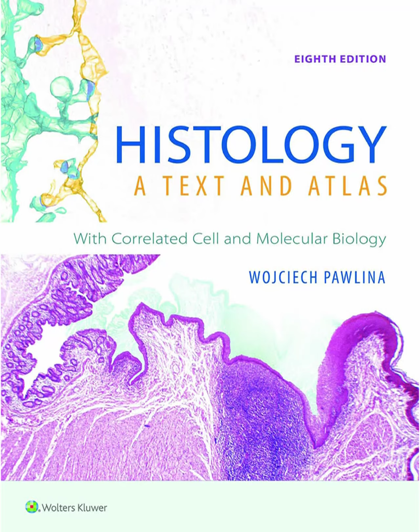That's ingenious. Just make the target bigger. It is. And it's led to a new field called expansion pathology, where this technique allows pathologists to see nanoscale details relevant for diagnosis, things that previously might have required much more complex and expensive electron microscopy. Mind-blowing. Okay, it's astounding how much goes into preparing these slides and developing ways to reveal their secrets. But now, let's shift focus slightly to the incredible instruments themselves, the microscopes. What does all this prep mean for how the microscopes actually work?